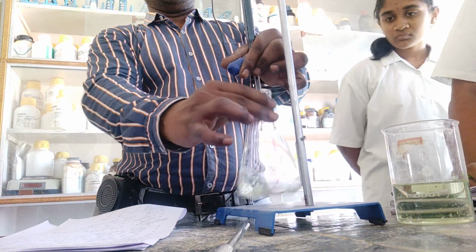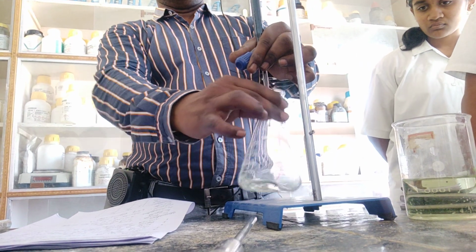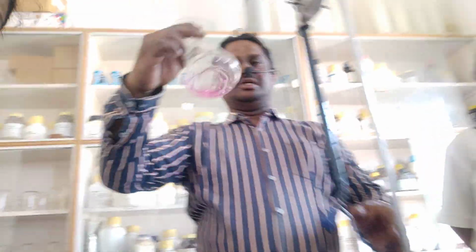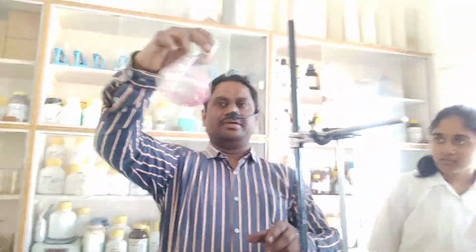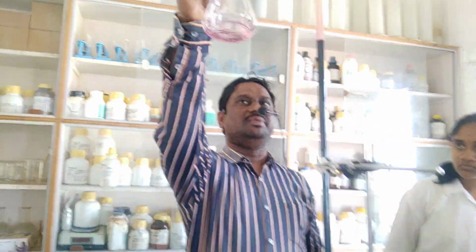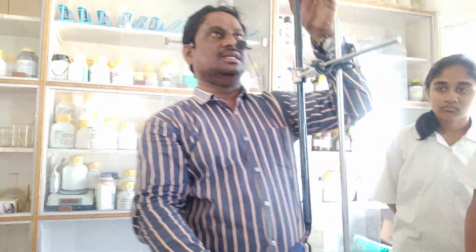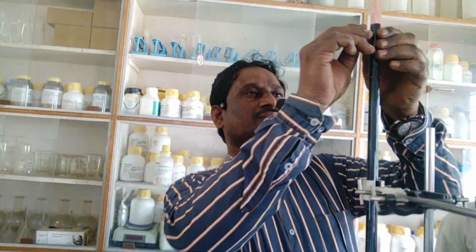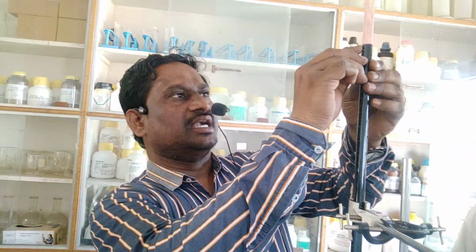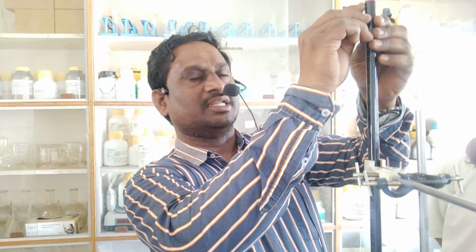So slowly I am just releasing drop wise. You can observe here only drop wise I am releasing. Don't release fast. Change. Now observe here carefully. Wherever it is there on the walls also, just like this. This is pale pink, children. Don't make it dark pink. You observe the readings here. See, from 0 I started. If you observe here, exactly 1.5 ml. I observed the readings here.